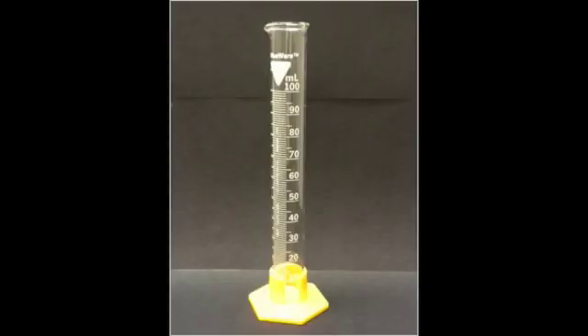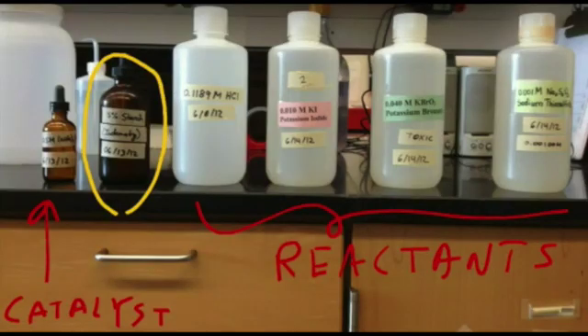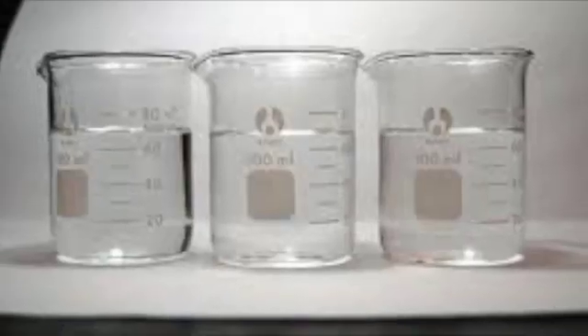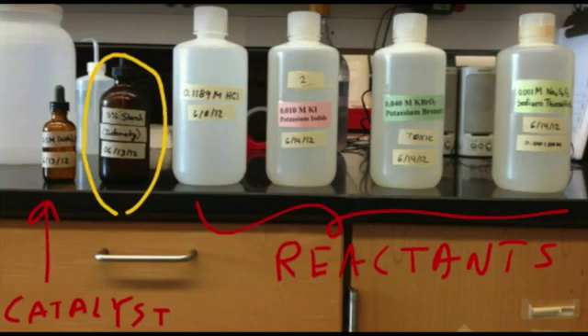First, use a graduated cylinder to get approximately 100 milliliters of each of the reagents: potassium iodide, potassium bromate, HCl, and sodium thiosulfate, and put them in separate beakers. All these reagents will be found in reagent bottles stored inside the fume hood.